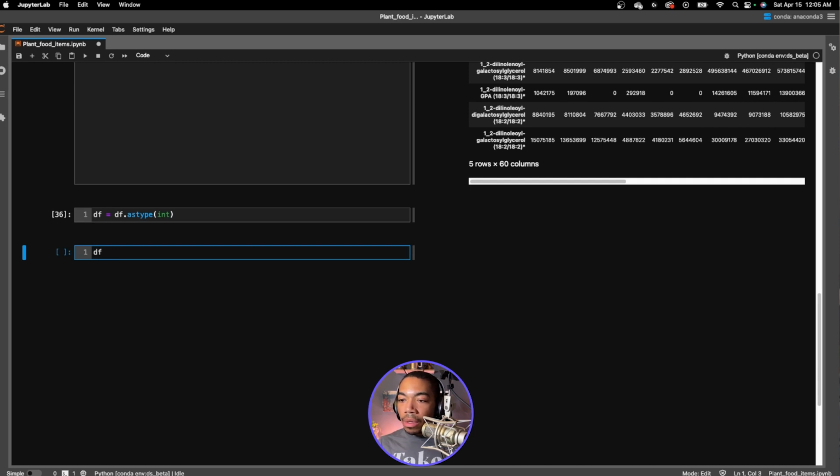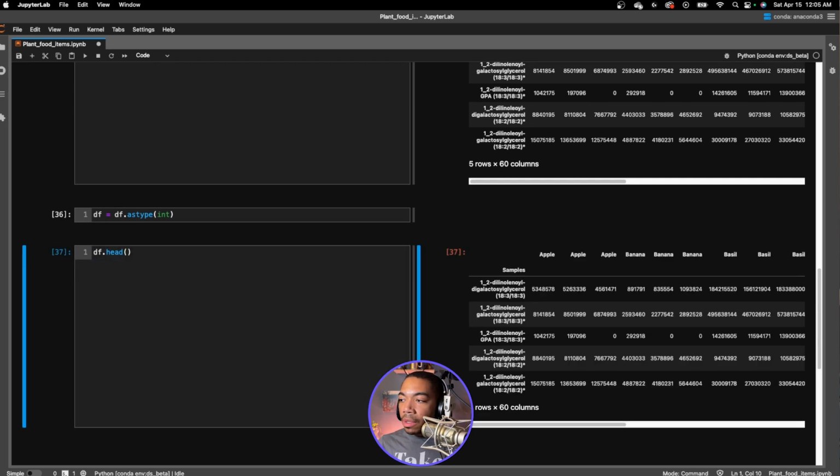One thing to note is that in this case, I don't necessarily care about the triplicate injections. There are cases where we might, and we could assess the relative standard deviation of each of these measurements, but that's not really the scope of this video. In this video, I want to take the apple out of my data set and see which other botanical, or which other plant food, is most similar. So what I want to do is aggregate based on my column headers and just compute an average value for each of these metabolite signals.